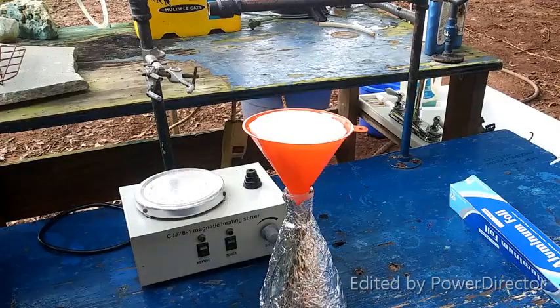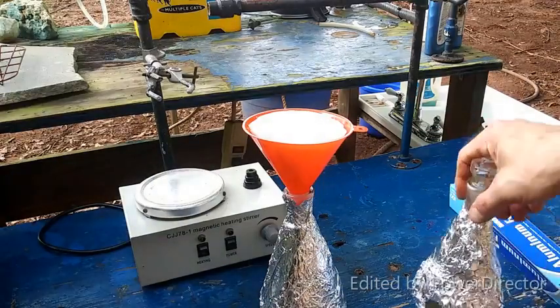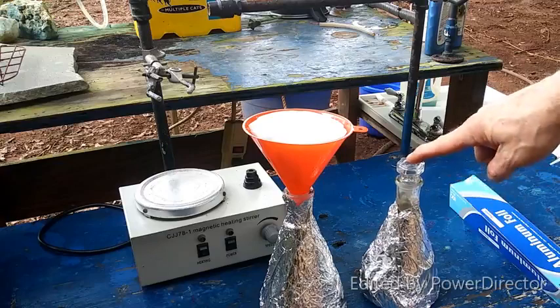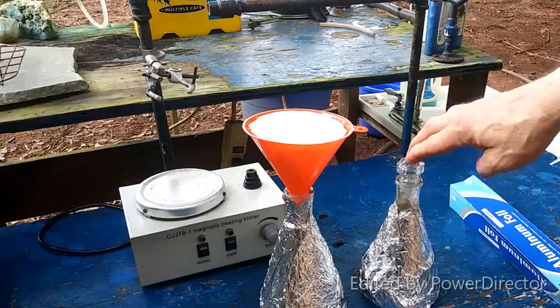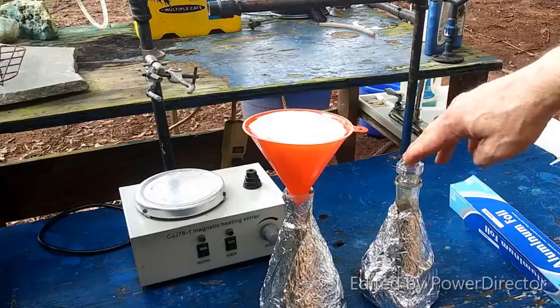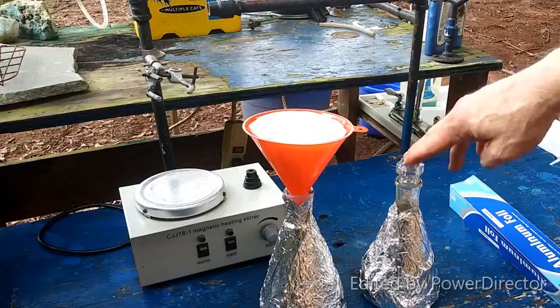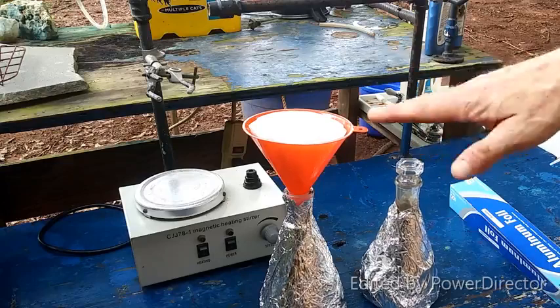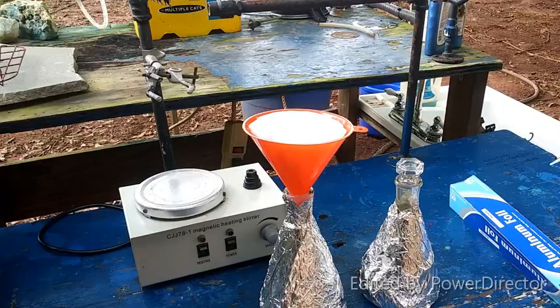Alright, everyone, it is the next day, and I'm about to go ahead and filter this to get off all the salts, the sodium chloride, and excess sodium iodide. According to Wikipedia, diiodomethane does not like light. Generally, when that's the case, it likes the sun even less. So everything is wrapped up in aluminum foil here, but you already saw it, so you know what it looks like.